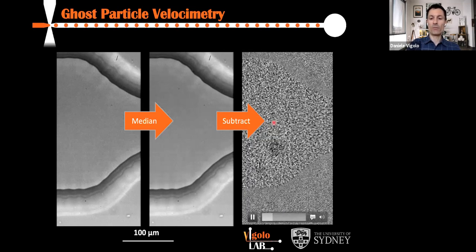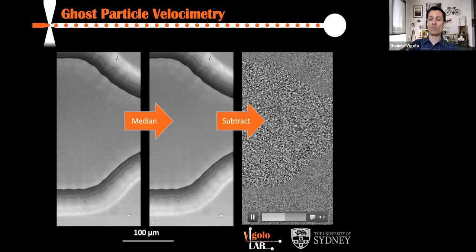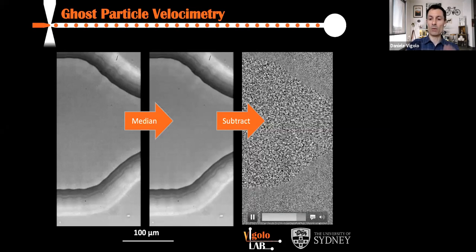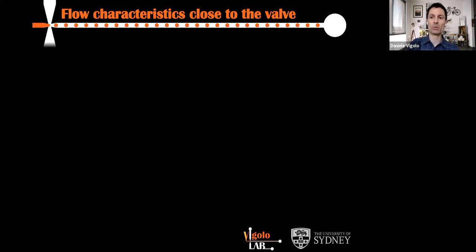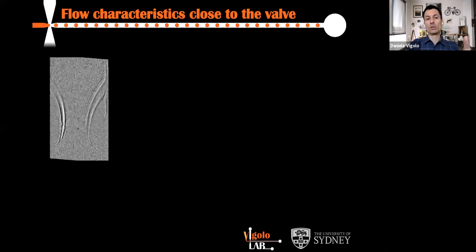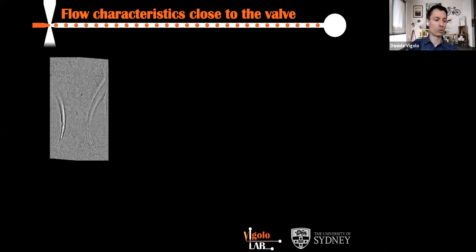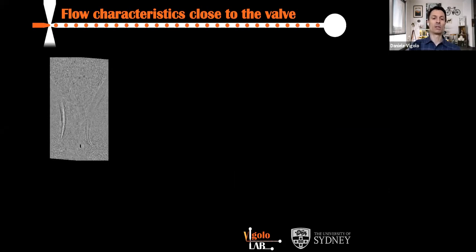And again, if your eyes can pick up the direction of the flow, so can obviously a software, and we can extract all the information in terms of direction and magnitude of the flow pattern. And that's exactly what we've done with our device. So what you're seeing here is the speckled pattern. Again, these are not the particles. The particles are smaller and much more diluted than what you see there. That's just an optical effect, but that's directly related to the flow field.